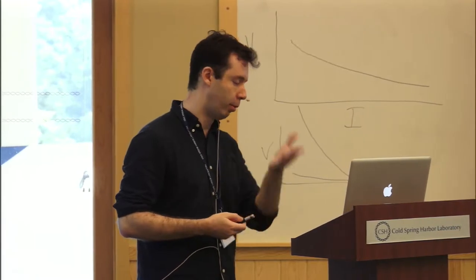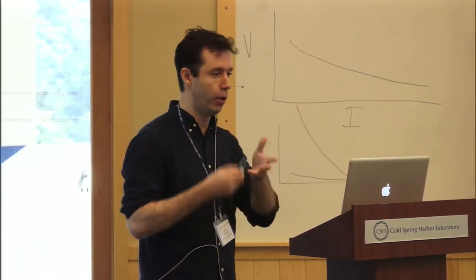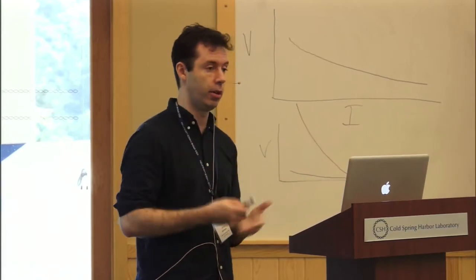But that can lead to problems. For example, Bowtie doesn't do its clipping, I think, and therefore you would see a lot of reads that don't map to the genome, and you'd be like, okay, what's going on? Reads don't map.